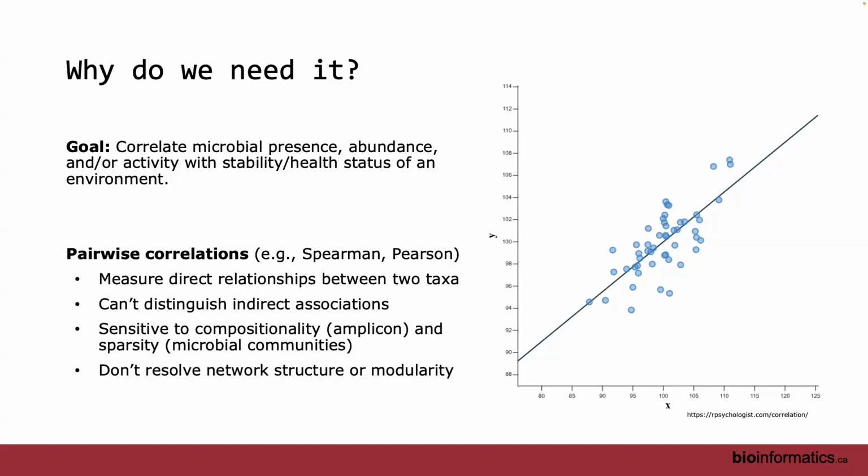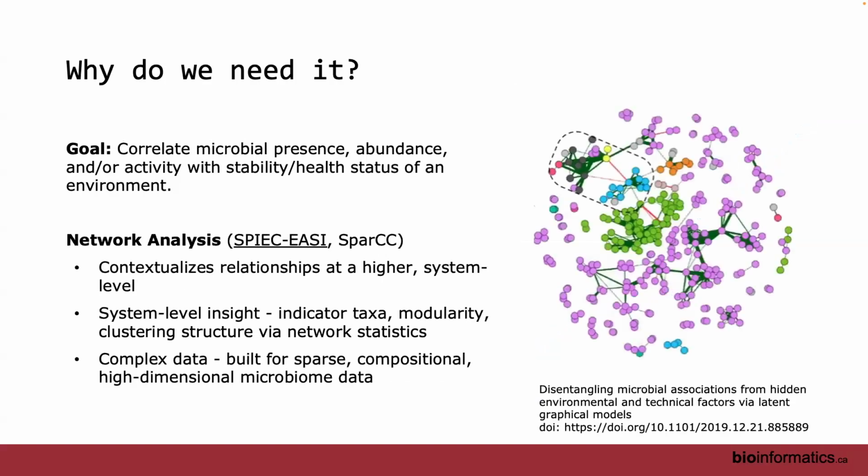We did show you some methods for transforming your data to help with that, and thereby you can apply some of these pairwise correlations. But if there's other methods out there, maybe we should try those as well. And then they also don't give you very much structure with respect to actually visualizing and then calculating some of those metrics that I talked about that a network can actually allow you to calculate.